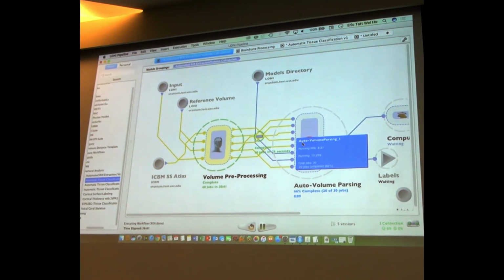I believe it's assigned per MAC address, which means that on this machine, every time you open the pipeline client, it's going to default to the same guest. But if you switch a machine, or maybe even if you switch a network, you may have to remember the guest ID, because without you entering it, it's going to give you a new guest ID, and you're not going to be able to see the workflows that you started.